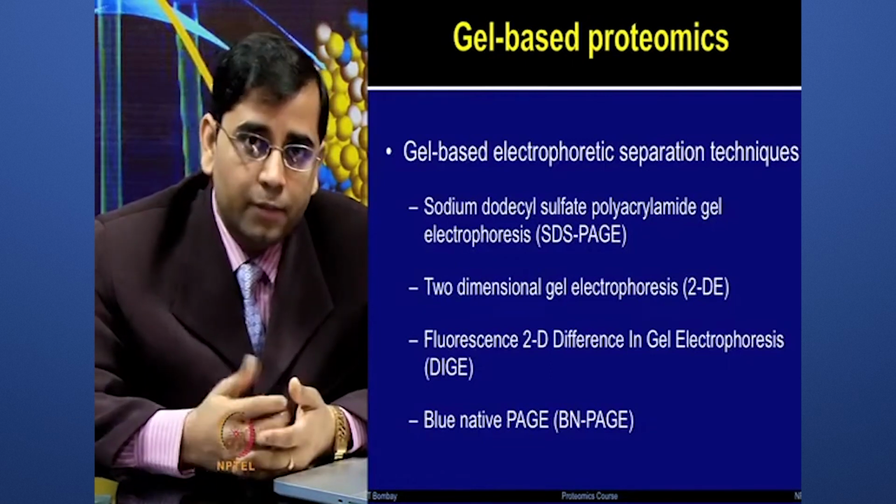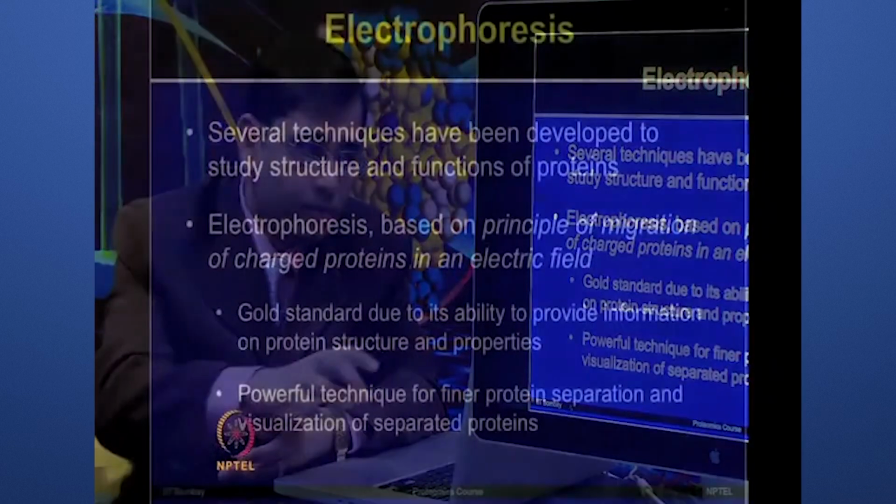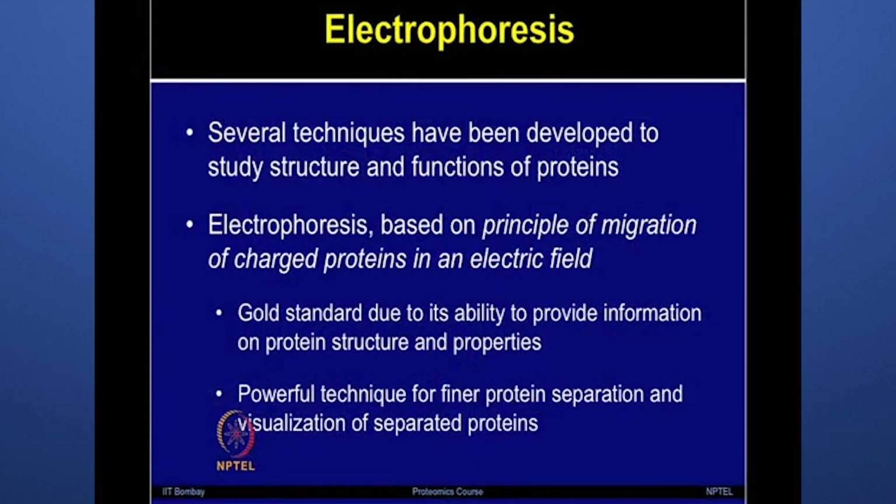There are different methods as well, which have been developed to study the structure and function of proteins, and electrophoresis is very important in that direction, which is based on the principle of migration of charged proteins in a given electric field.